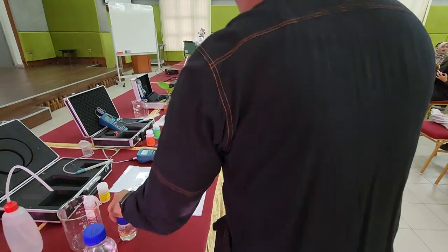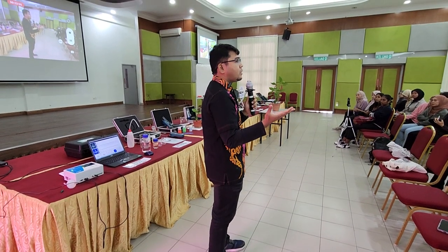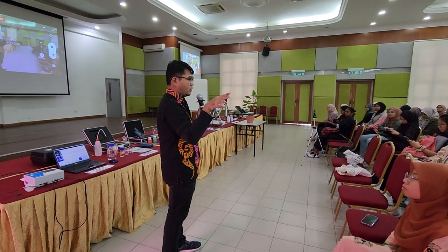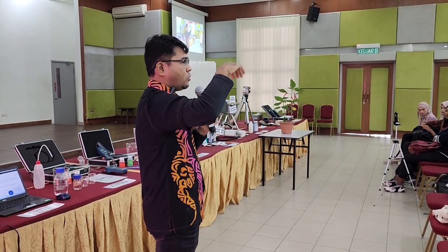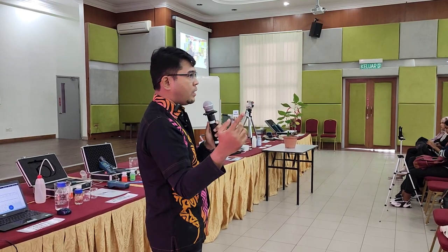So EC is the measure of electrical conductivity, meaning that in a solution, ions are present and ions have charges, positive, negative, and so on. These differences in charges create a potential. When there is a difference in potential, equilibrium needs to be set in place. In order to have this equilibrium, it will create a movement of electrons from one place to another. When it's moving, trying to achieve equilibrium or trying to find its positive pair, this can be measured.